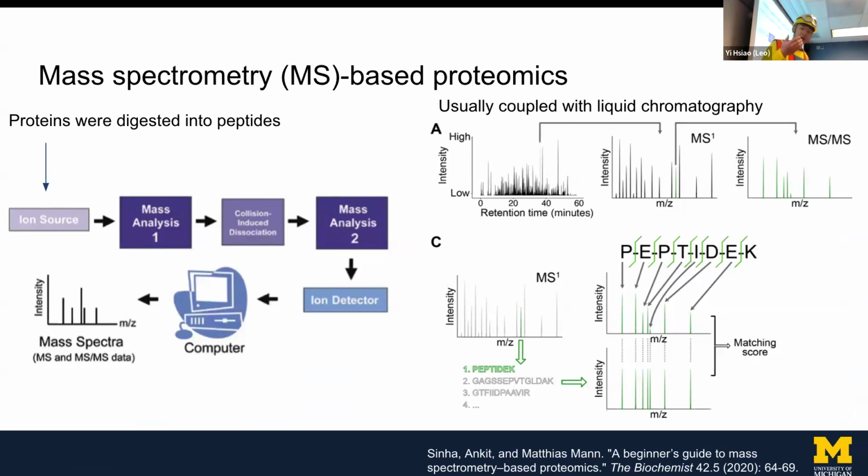And another step back, I figure people might not understand what mass spec-based proteomics is that much. You might hear about transcriptomics a lot, but proteomics is a kind of omics data closer to the phenotype, so it's also gaining much more interest. And there is more than one way to do proteomics, but the topic I'm going to focus on here is still mass spec-based proteomics.